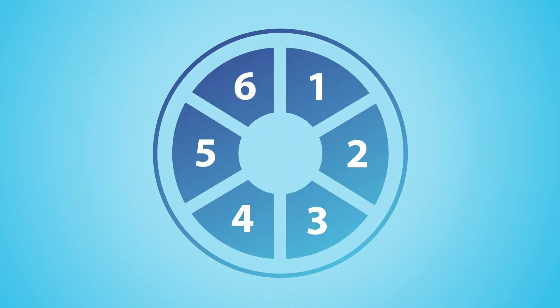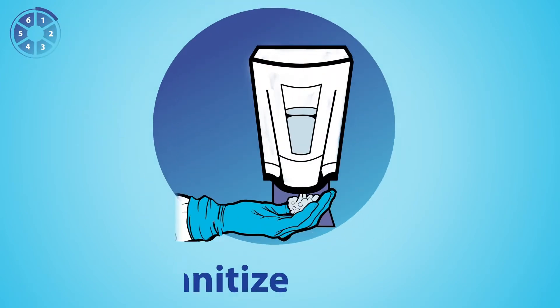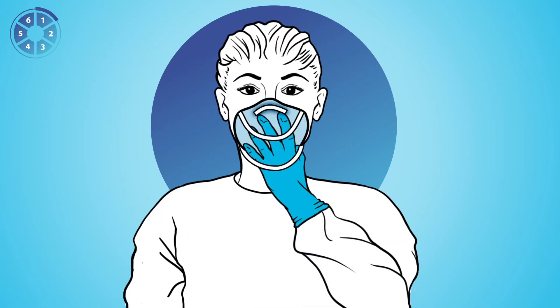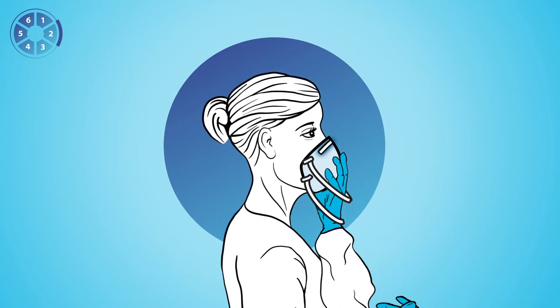Donning can be performed in six steps. One, perform hand hygiene and, using one hand, place the respirator on your face with the nose piece at your fingertips. Allow the straps to hang freely. Two, make sure to check that the nose piece spans and covers the bridge of your nose, as well as the respirator cups your chin.